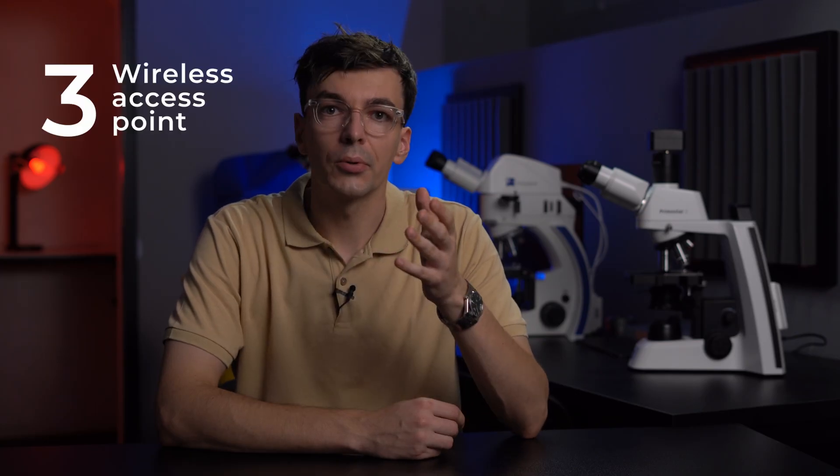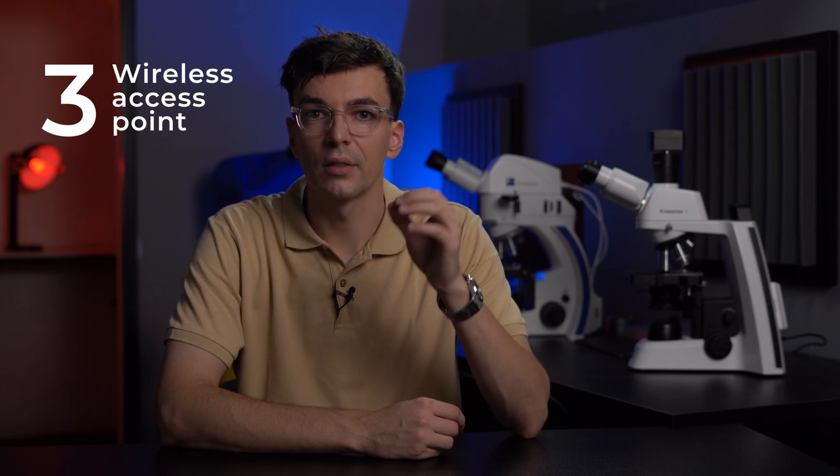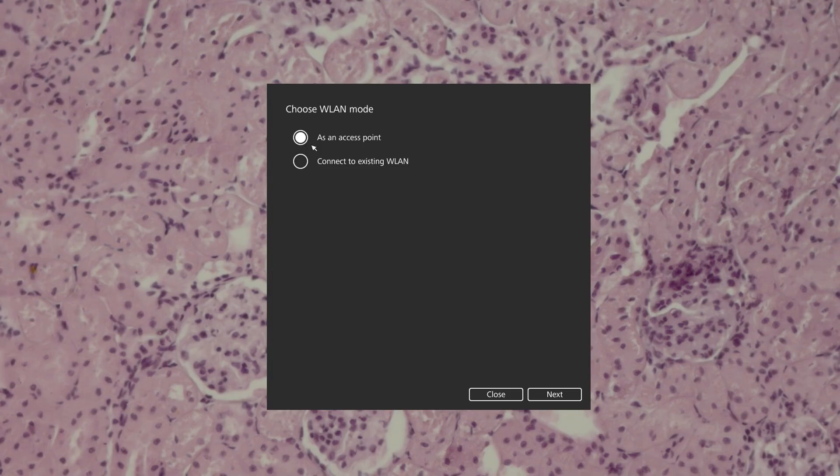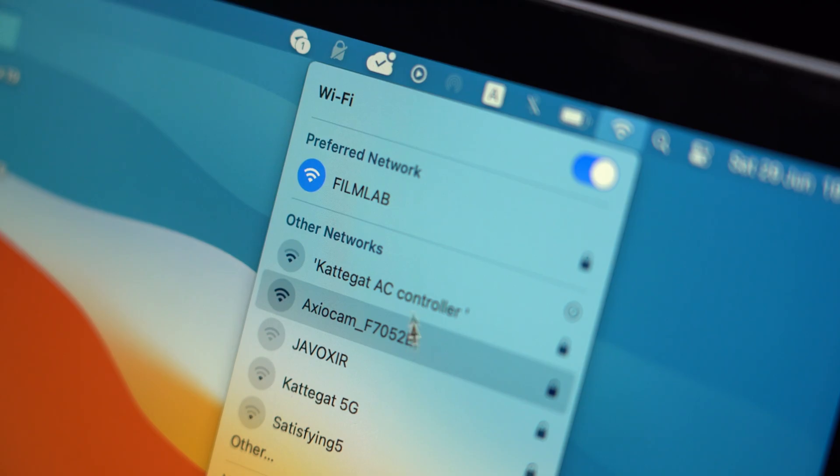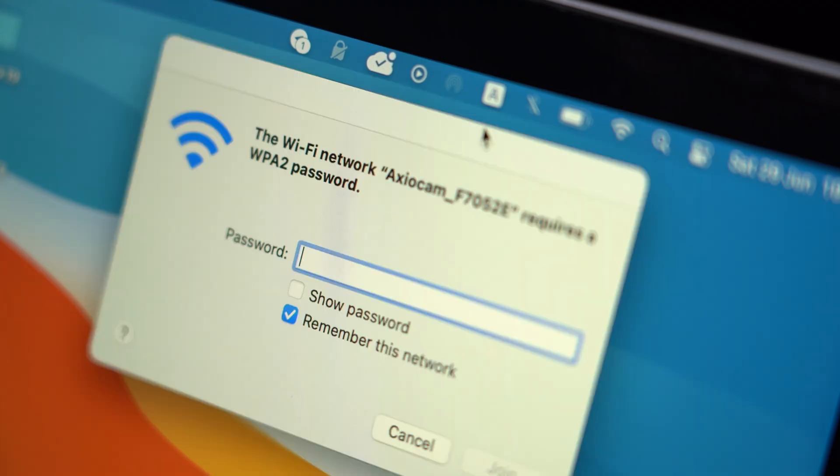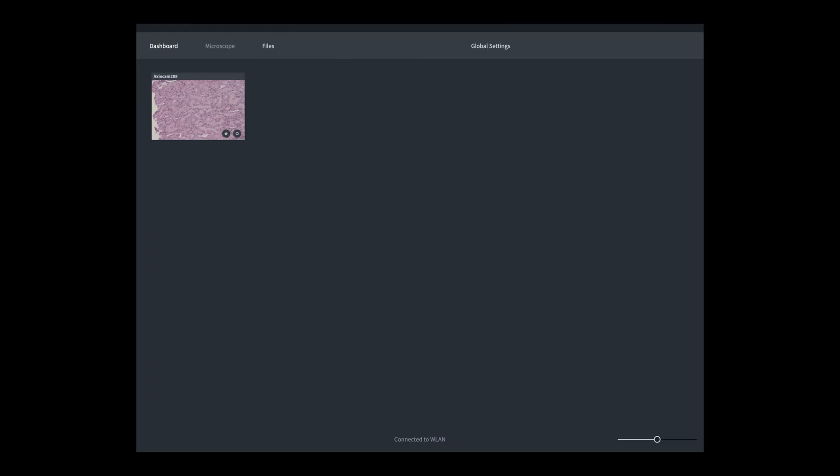The third option is to create an access point using the Axiocam. We need to do the same steps as in the previous topic, but in the Wi-Fi settings we need to change the selection to as an access point. Your camera has now become an access point. Connect your workstation to this network using the password and Axiocam 208 will appear in the list of available microscopes.